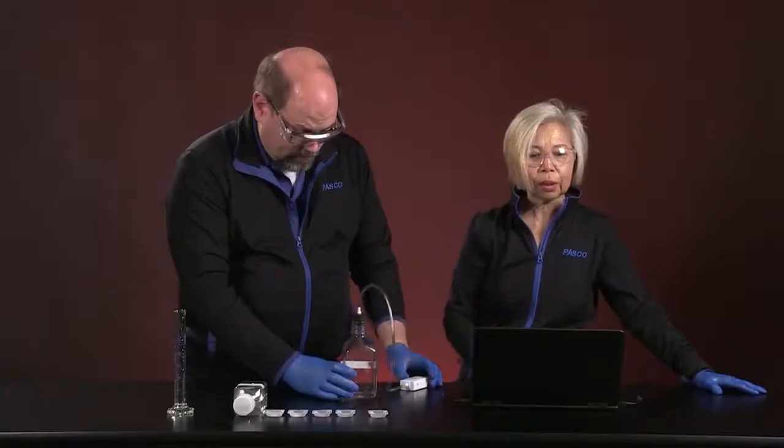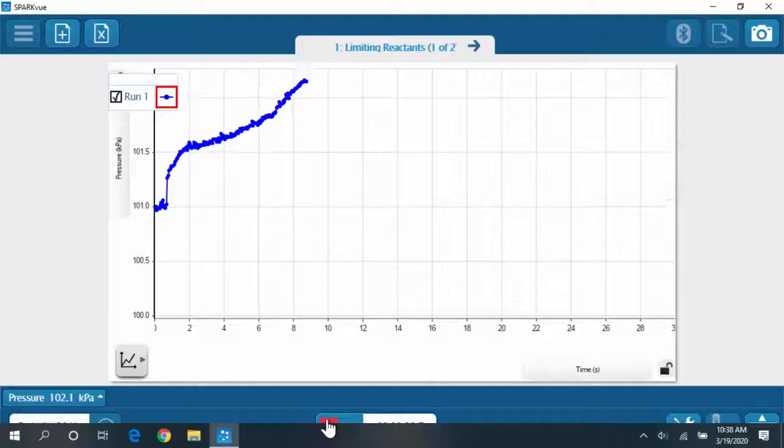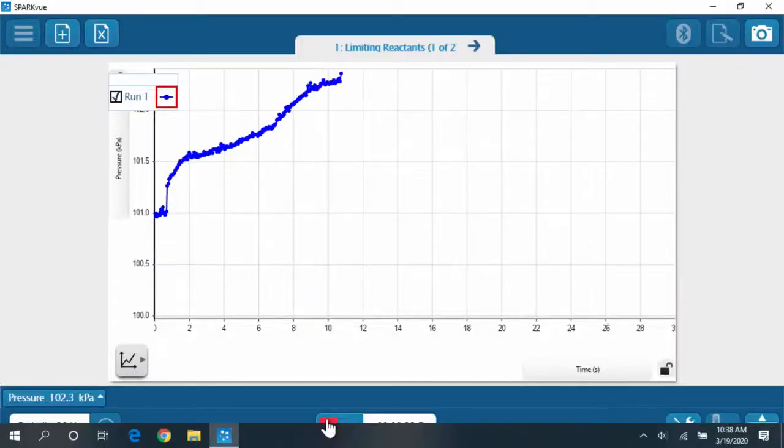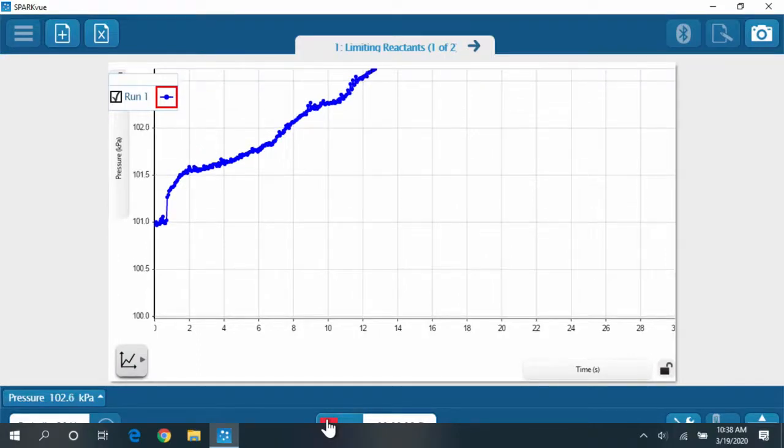Swirl it around just a little bit. Oh, you can already see that gas is being produced and that is indicated by the change in pressure.